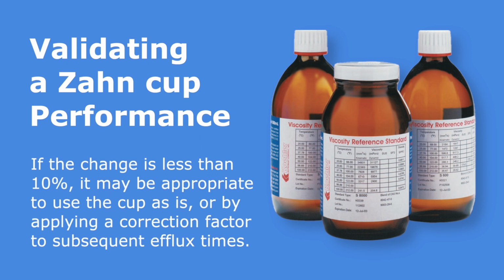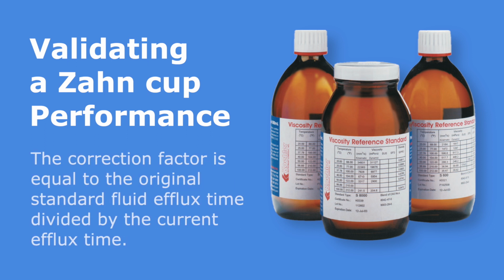If the change is less than 10%, it may be appropriate to use the cup as is, or by applying a correction factor to subsequent efflux times, depending on the degree of precision required. The correction factor is equal to the original standard fluid efflux time divided by the current efflux time.